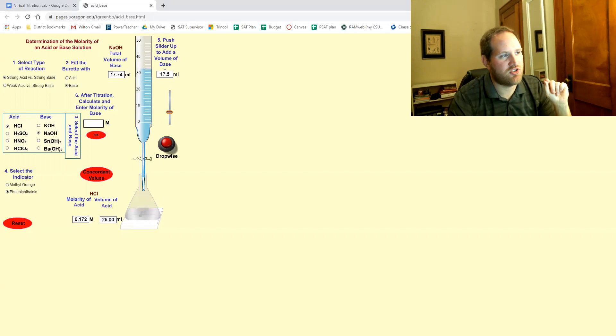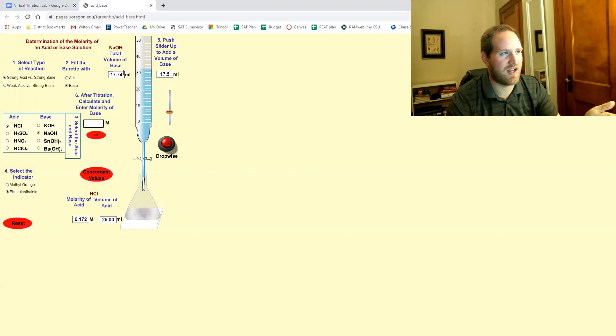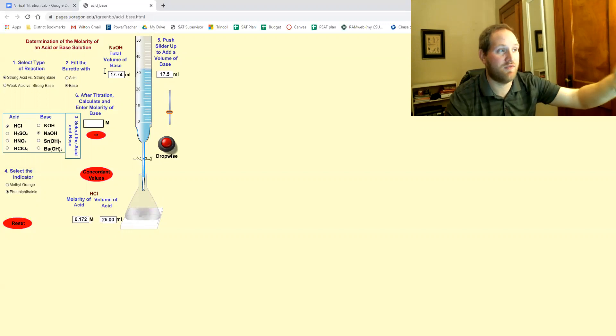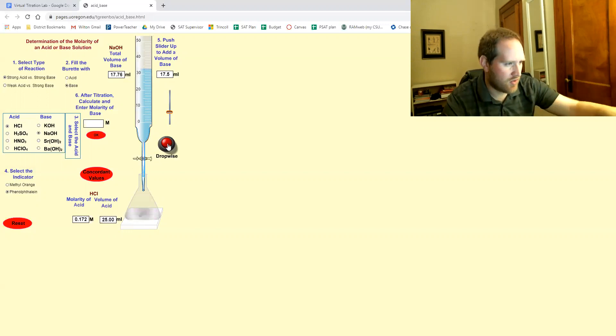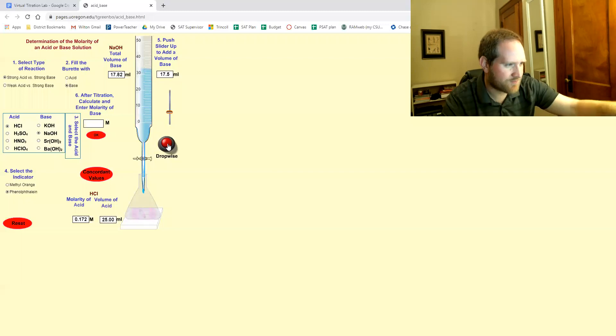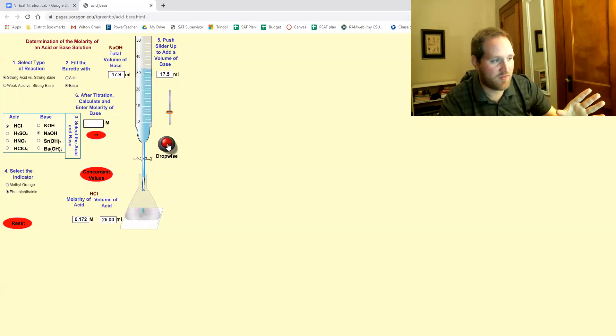Now this, I almost wish it didn't show this now because it kind of makes it confusing. We haven't added 17.5. We've added the full 17.74. So I'm again now looking at the color and I need to get it to the point where it stays pink.